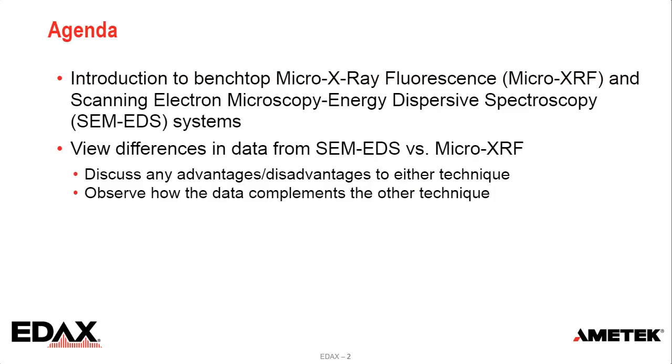So in this webinar, first, I'm going to give you a brief introduction to the benchtop Micro-XRF and SEM-EDS. Then I'm going to show you differences in data from SEM-EDS and Micro-XRF. The goal is to discuss any advantages and disadvantages to either technique and to observe how the data complements the other technique.